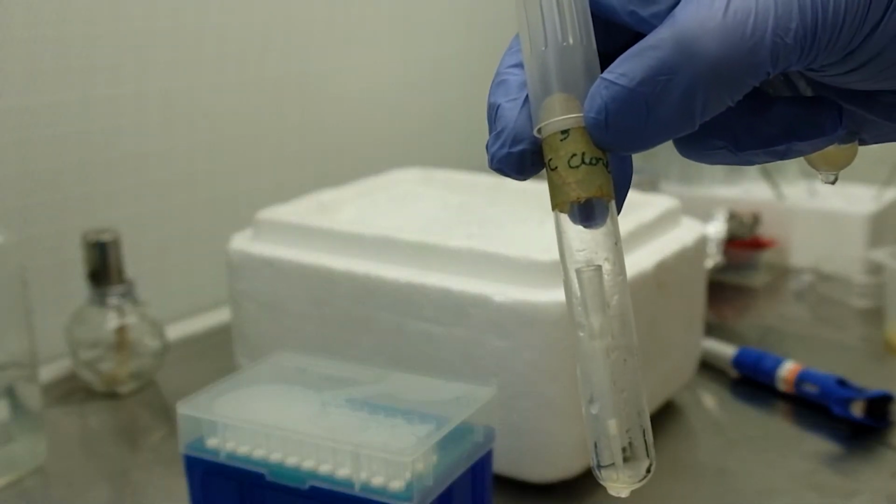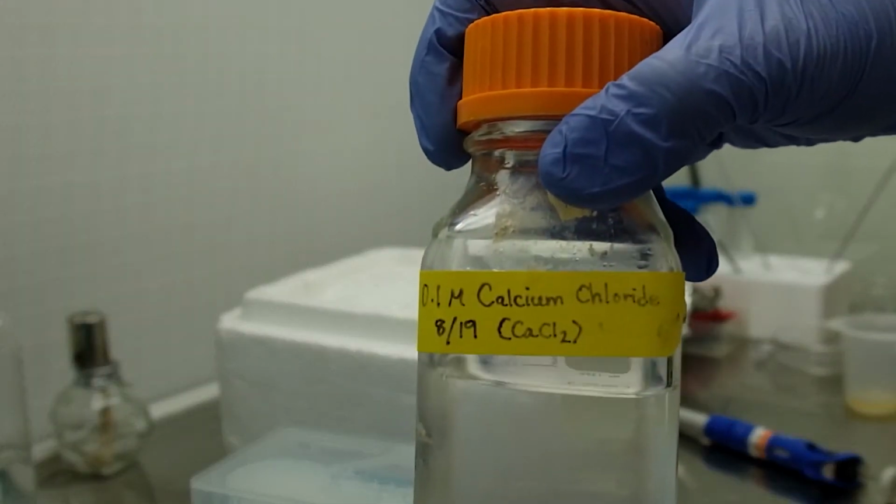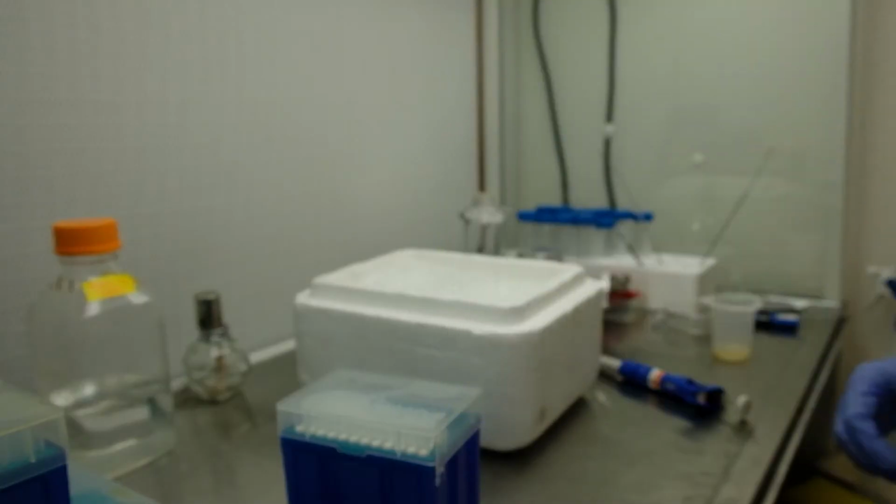When your cultures run out, you will need to fill the tubes with calcium chloride for the final centrifugation step.